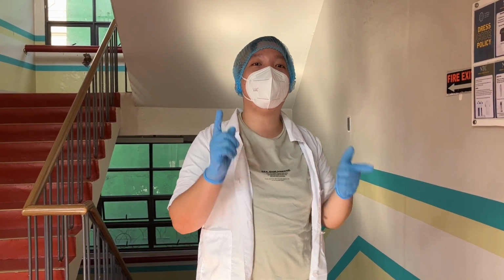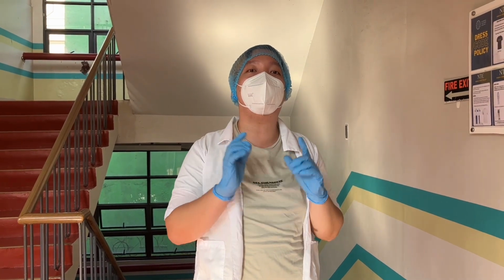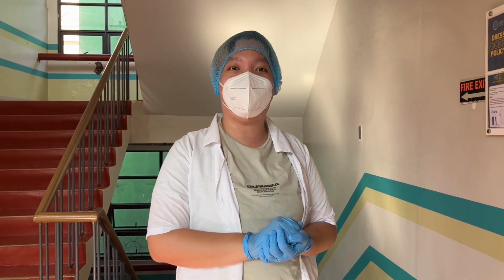Ngayong umaga na ito, we are going to find out what are the rules and also the definitions and examples of what to do inside the chemistry laboratory. So let's go at samahan niyo ako. Tara!